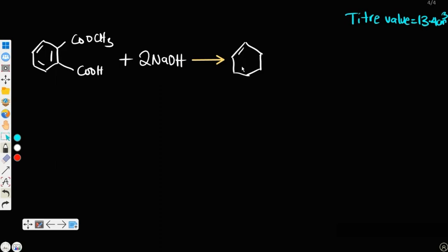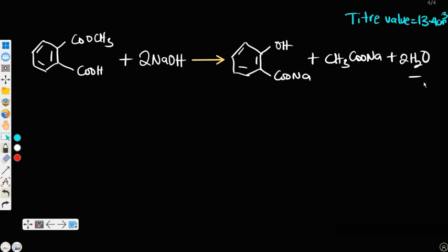Right? We're going to have something like this. Firstly, it's going to give us OH, and there will be COONa plus CH3COONa plus 2H2O. Now you must memorize this equation of reaction.